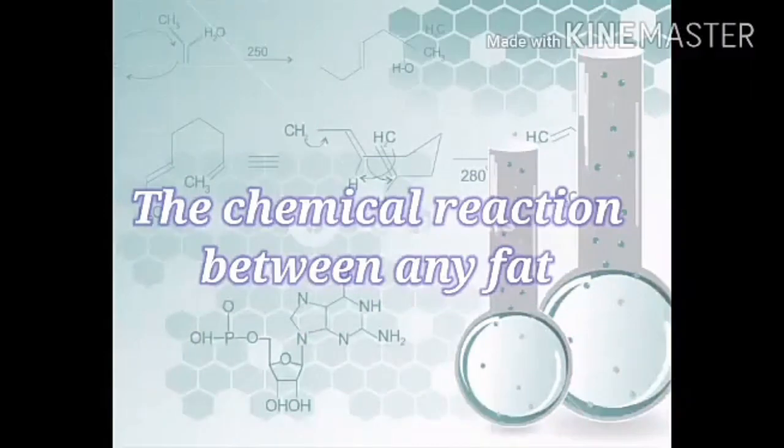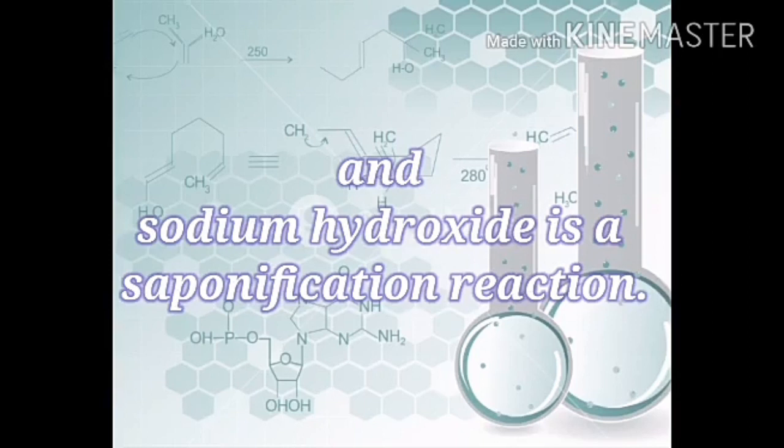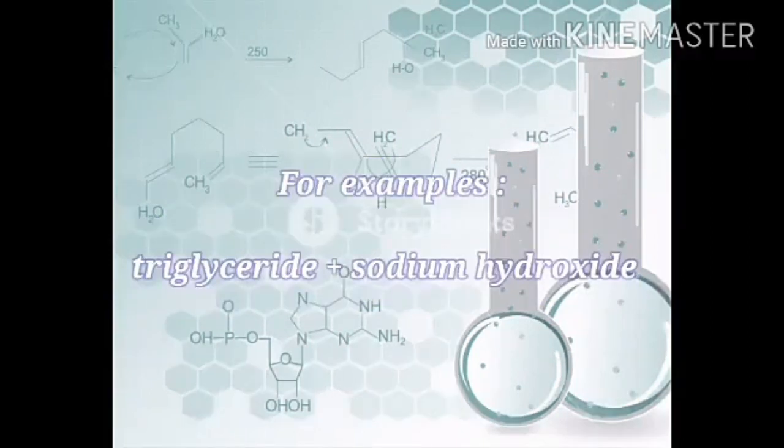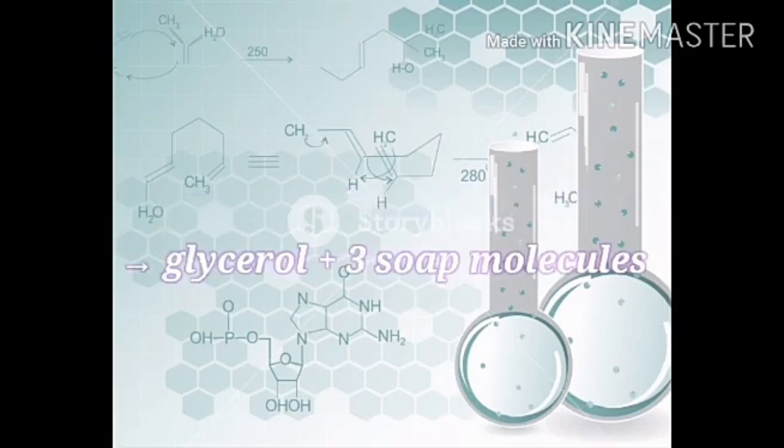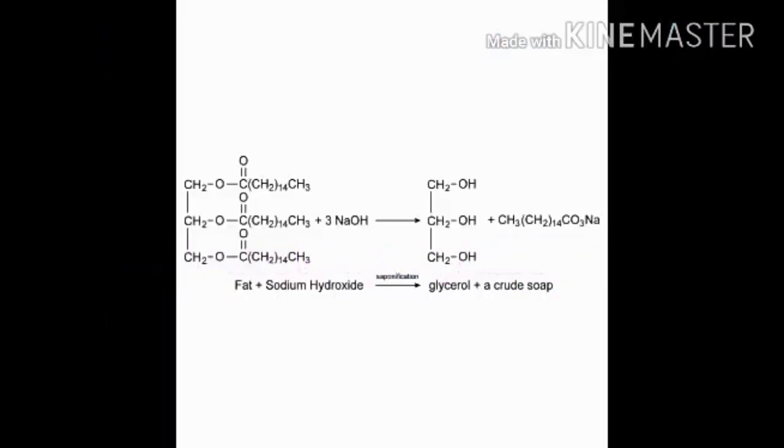The chemical reaction between any fat and sodium hydroxide is a saponification reaction. For example, triglyceride plus sodium hydroxide or potassium hydroxide will undergo saponification reaction to form glycerol plus 3 soap molecules.